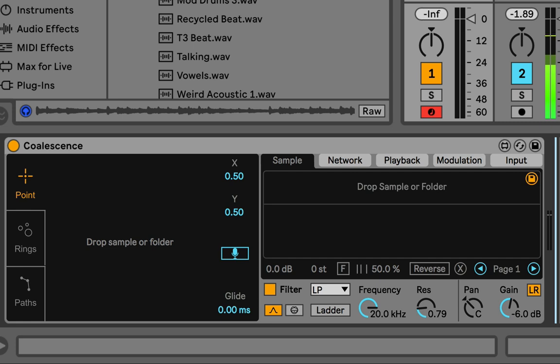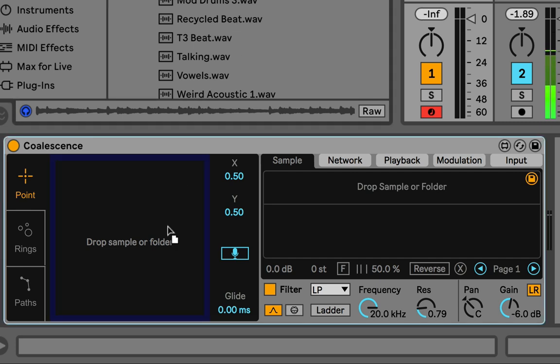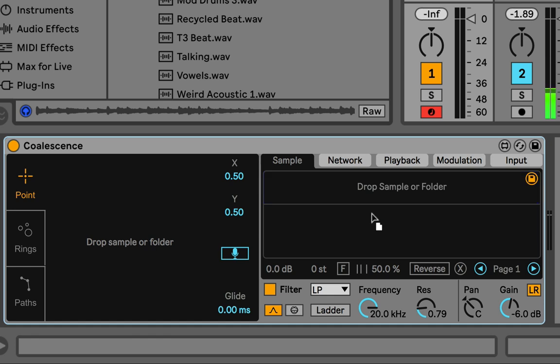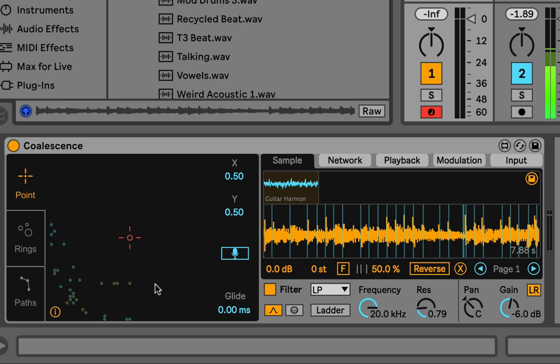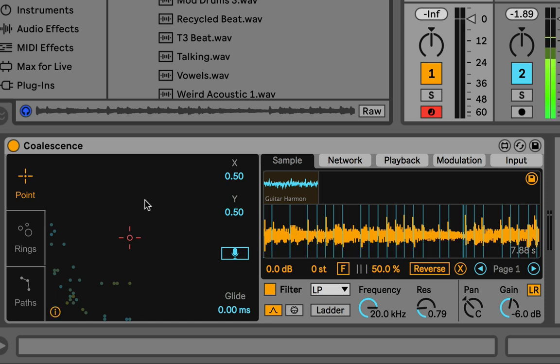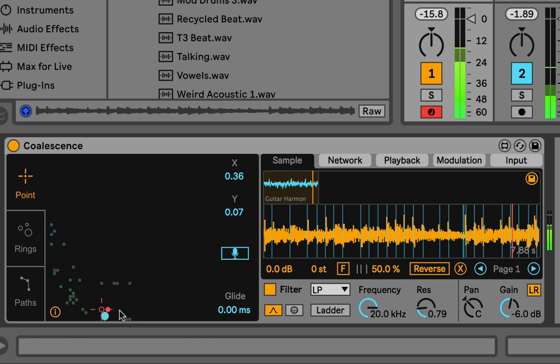As you know, you can drop the samples either on the network here or over here in the sample tab — it doesn't matter. I'll drop one in and it analyzes it, then cuts it up and puts it here in the network, and you can see these little circles are the slices.